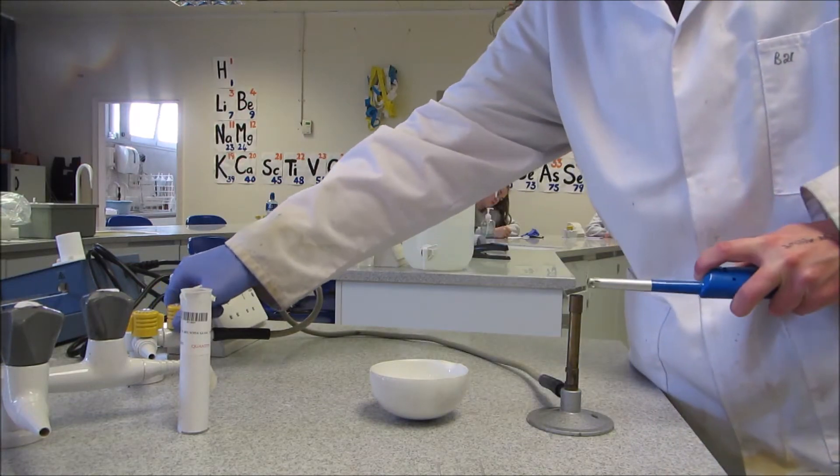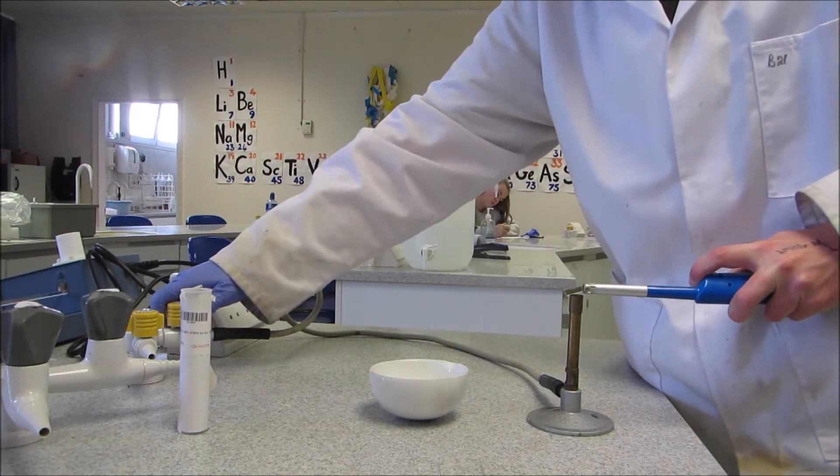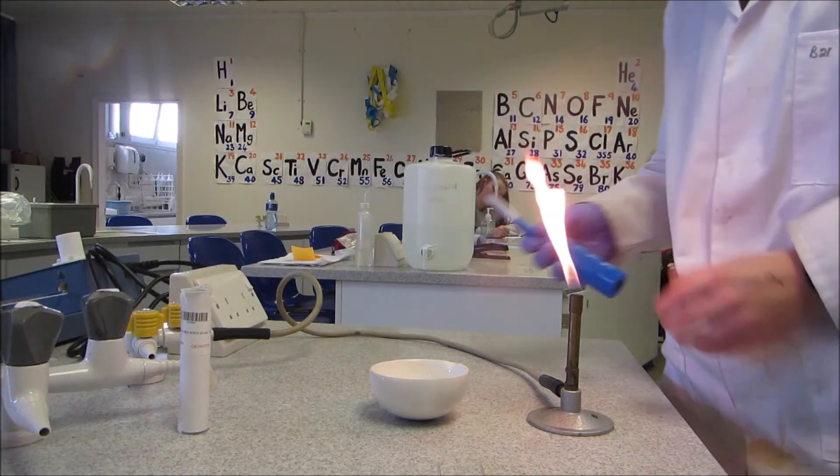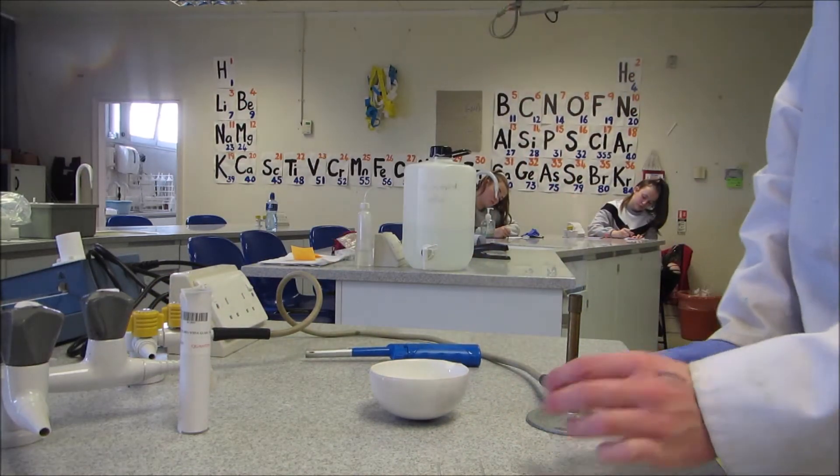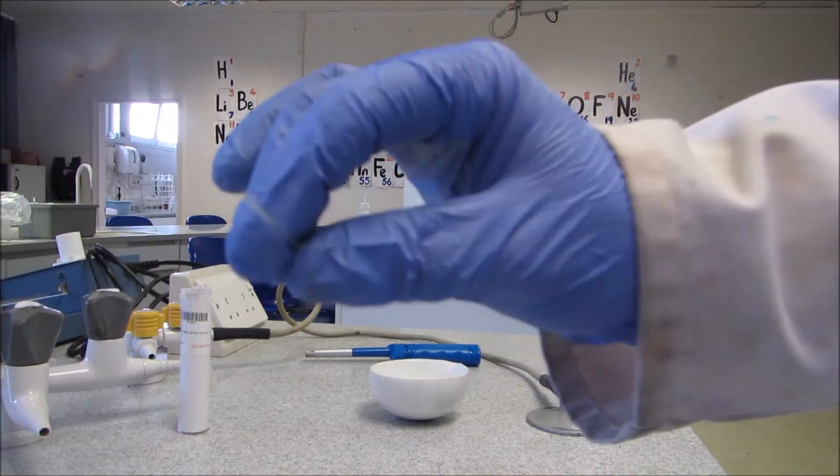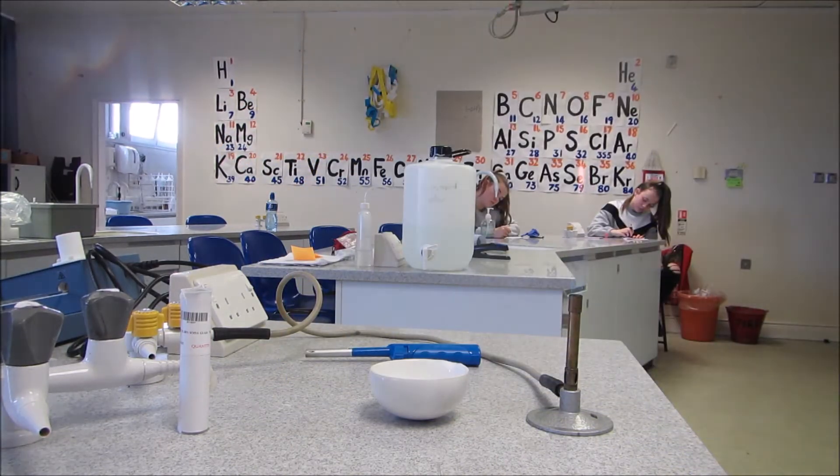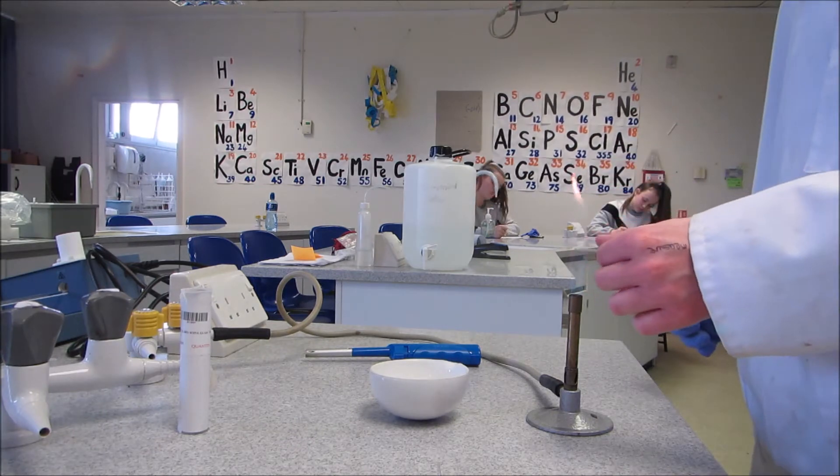So to measure the melting point of aspirin that you've made, firstly you've got to make a tube. I'm just using a capillary tube and you can see it's hollow in the center. So I need to make it so that it's round at the bottom.